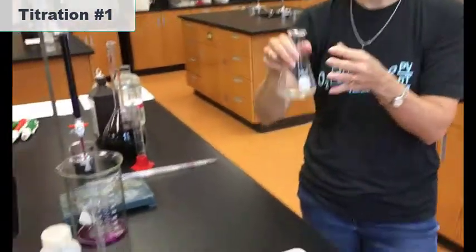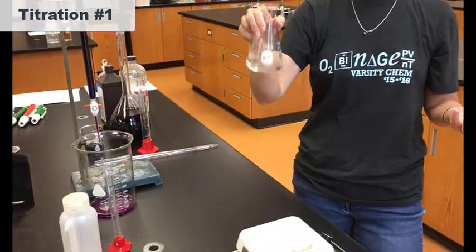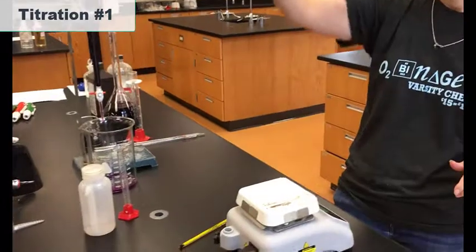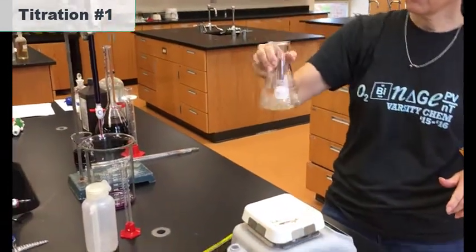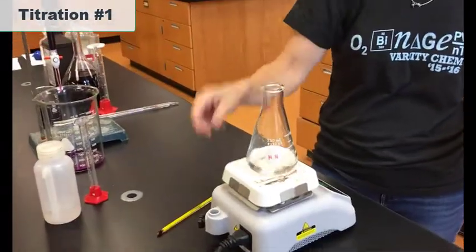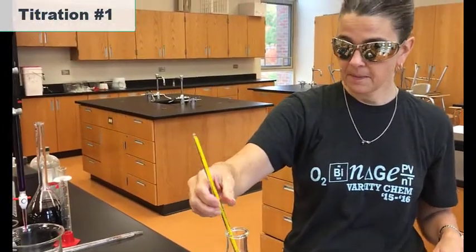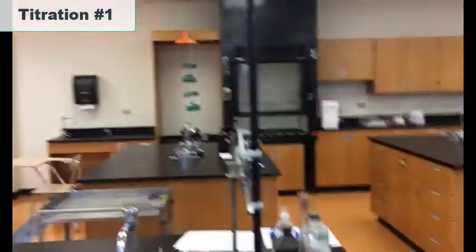because it needs to be acidic in nature. And then for this reaction to work well, we actually need to warm it. So once it's mostly dissolved, we're going to put it onto a hot plate, and we're going to get it up to somewhere between 60 and 70 degrees. And then we'll start with our titration.